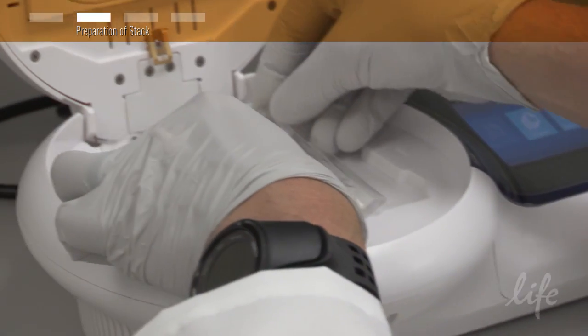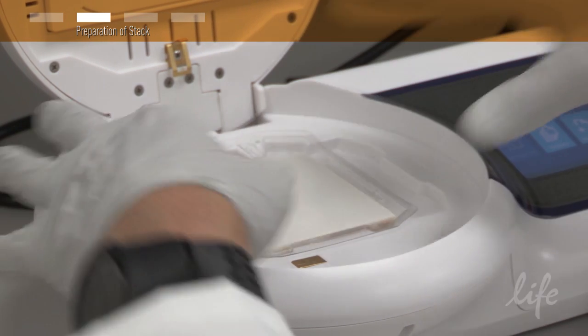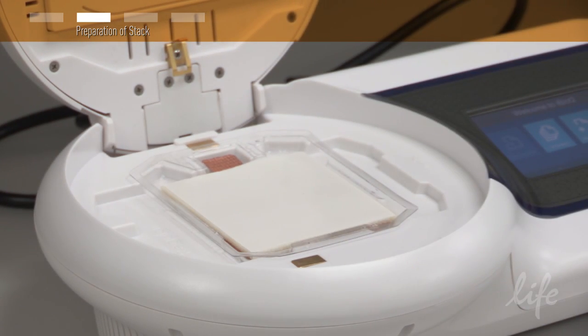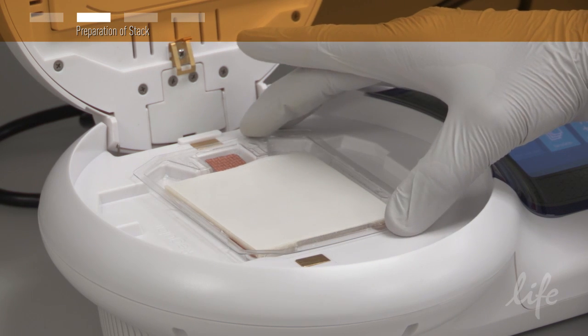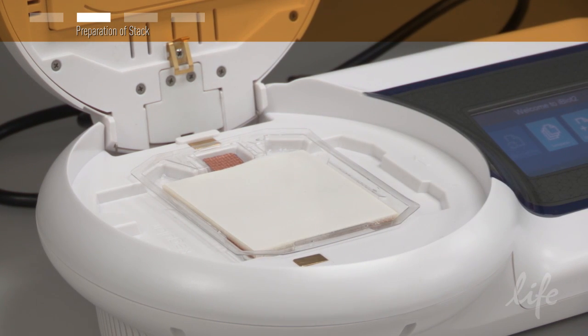Then, place the tray on the blotting surface of the iBlot2. Be sure to align the electrical contacts on the tray with the corresponding contacts on the blotting surface.